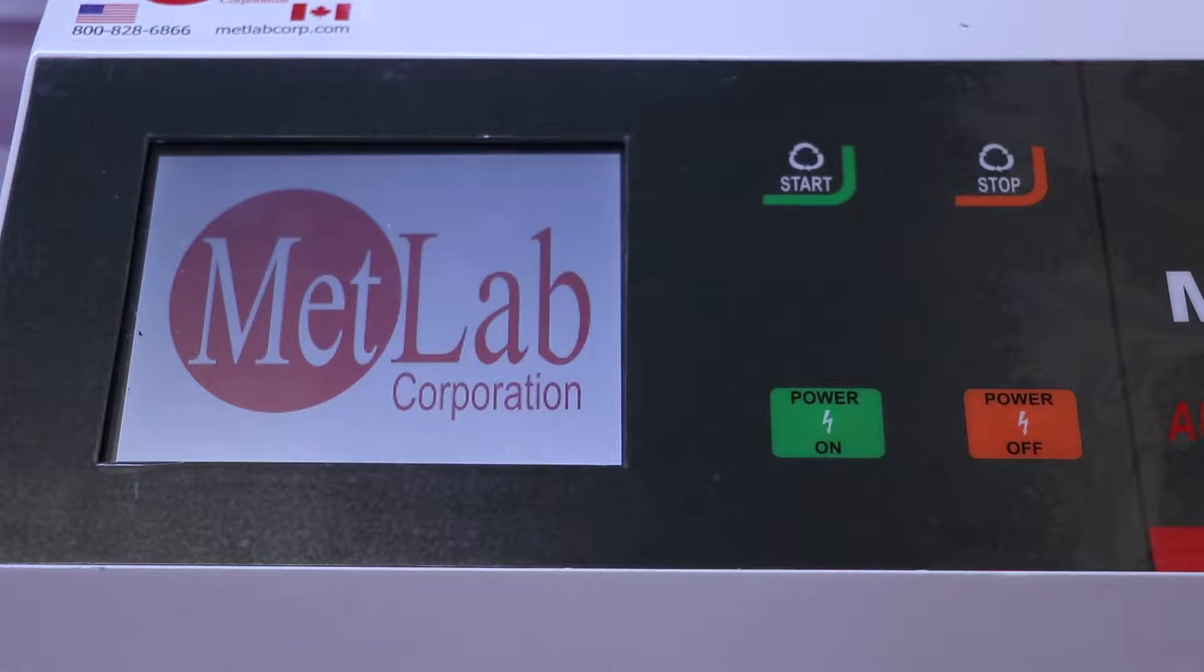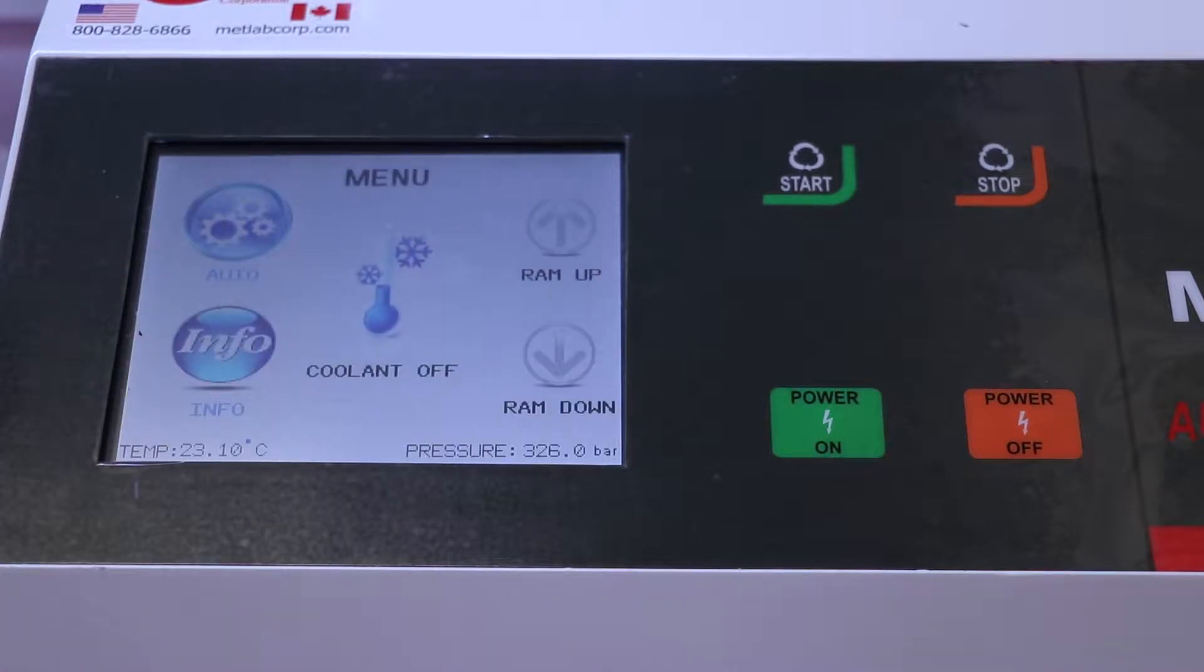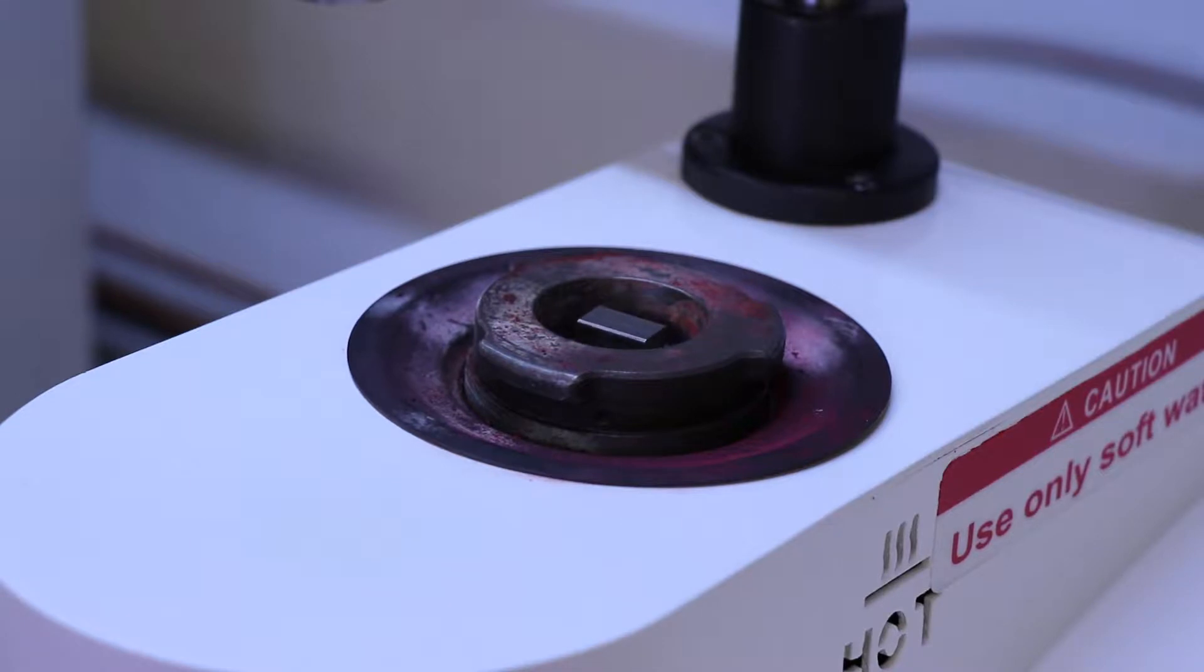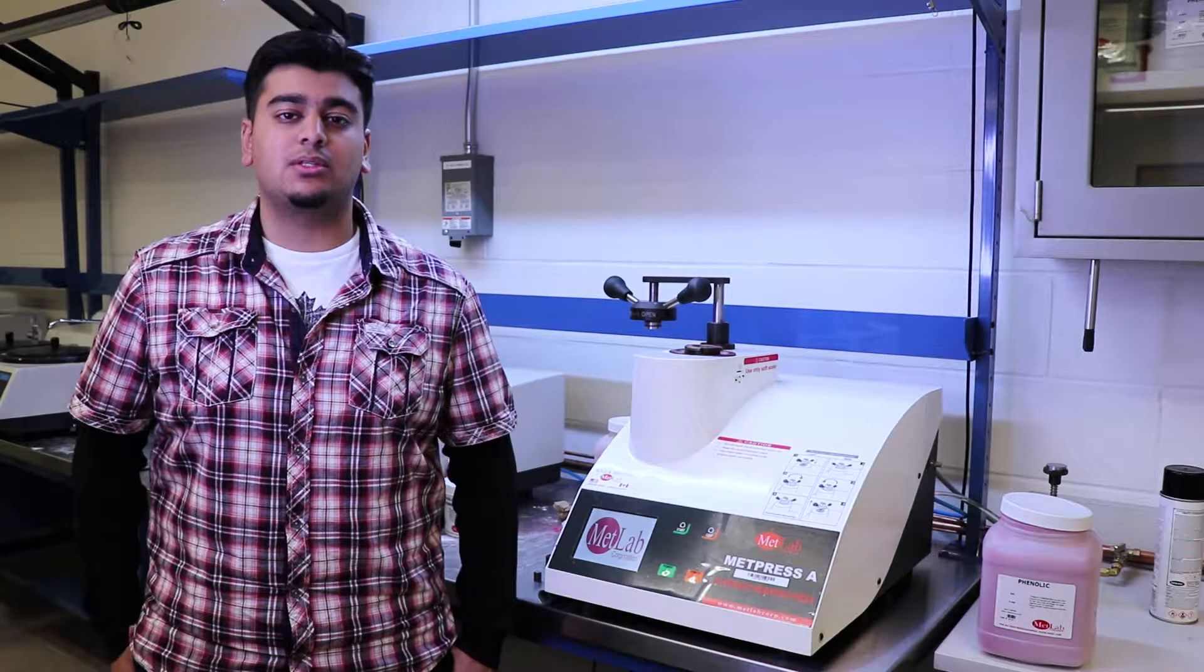Now after that, you're going to press the ram down button on the screen to bring the plate down into the machine. Now the lower you bring the plate into the machine, the safer you are at getting a better result of the shape of your puck.